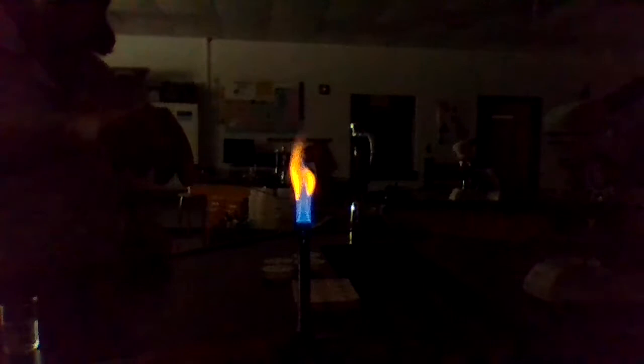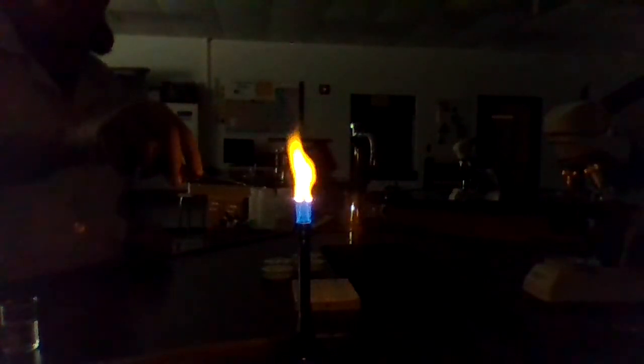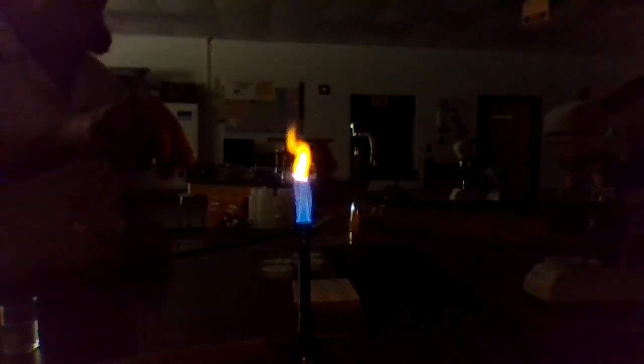All right, and then what you would do at this point is you would write down your hypothesis. It's hard to tell because they're all powders, but you would write down which powder you think is going to be the one found on the table in the restaurant. Is it sugar? Is it salt? Is it calcium chloride, potassium chloride, boric acid, or zinc chloride? So those are your choices. At this point in the lab, you would go ahead and write your hypothesis. So I'm going to give you a second to do that.